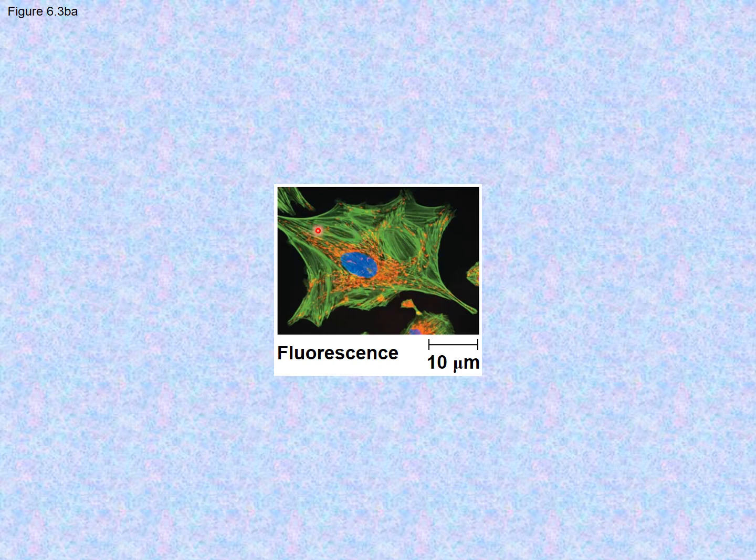So here we can see three different colors, right? So we've got the blue, we've got the orange, and we've got the green. The blue, of course, is the nucleus. The orange represents some of the organelles like the mitochondrion, and the green represents part of the cytoskeleton of the cell. So you can kind of highlight different structures within the cell, and this allows you to see a live cell moving around, right? So you can see the things moving inside the cell.